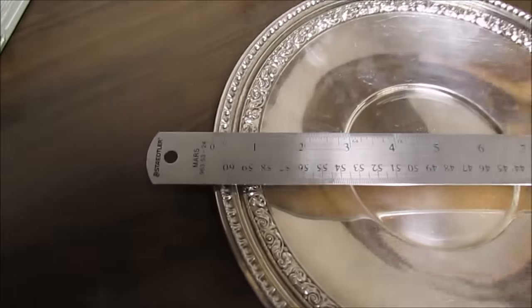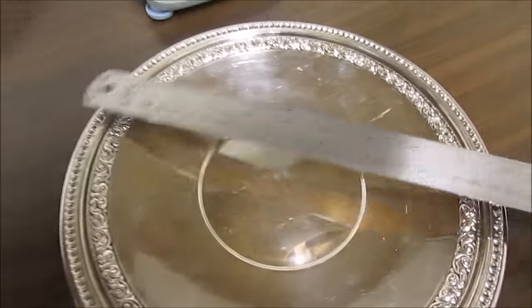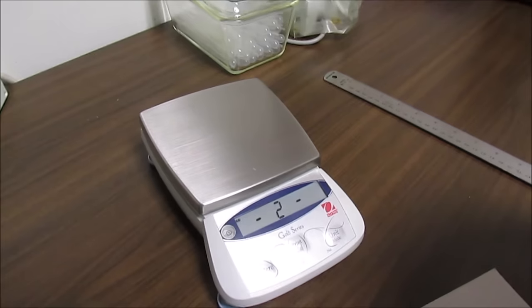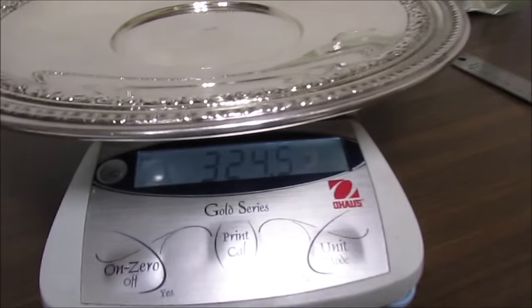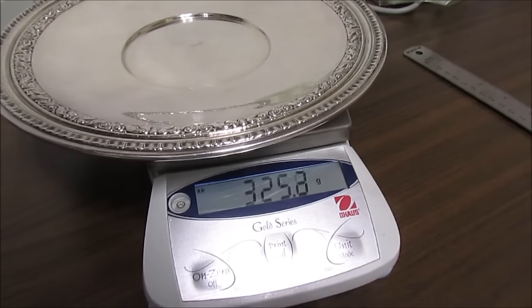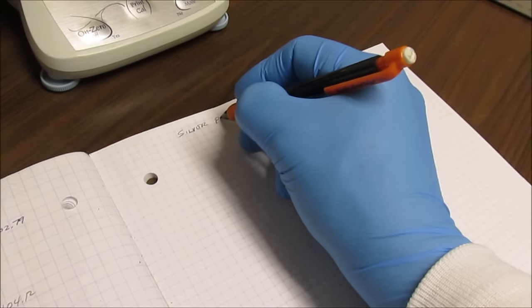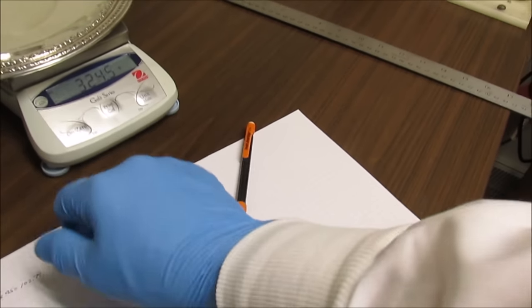To get started, I'm going to take a measurement — the dish is about 10 and a half inches in diameter. Now I'm going to get a weight on it so we can calculate a yield once we get the silver extracted. It looks like this thing weighs in at 324.5 grams. I'm going to go ahead and write that down: silver plate, 324.5 grams.